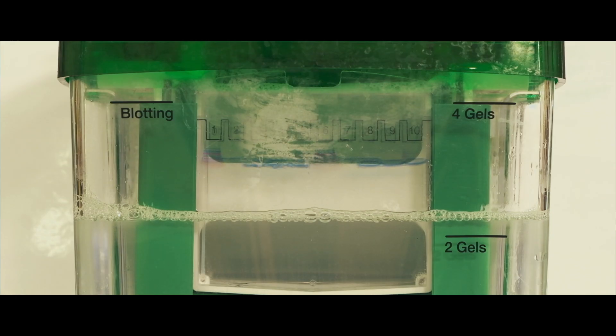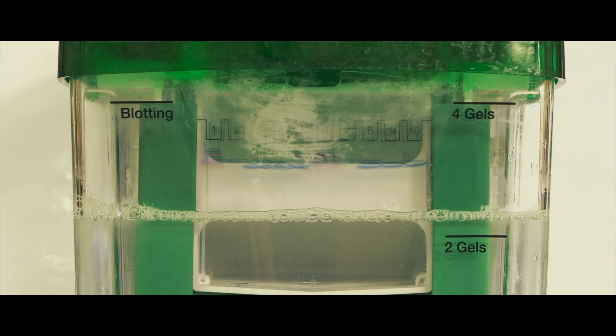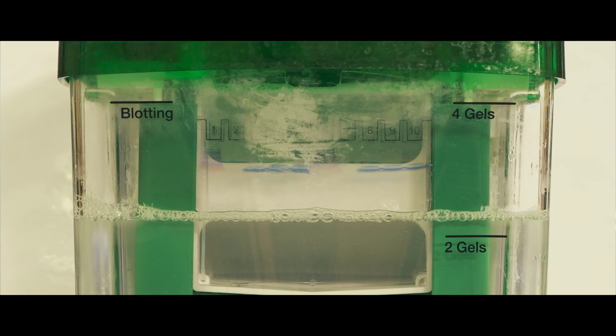The proteins are separated in a gel contained in a tank filled with buffer and connected to a power pack. The gel has wells in which the samples are placed. When a current is applied, the proteins migrate down the gel. Smaller proteins will be able to travel through the matrix within the gel faster than larger proteins.